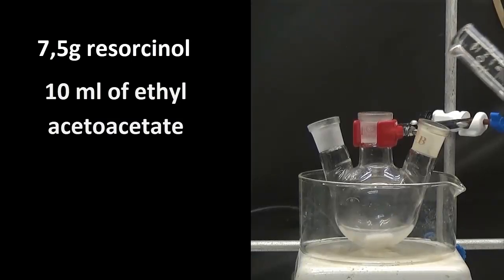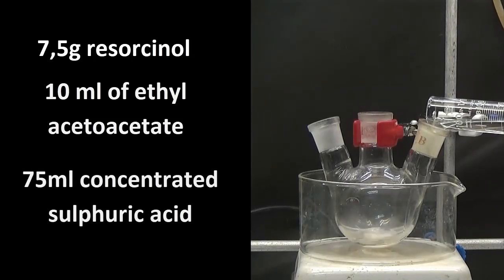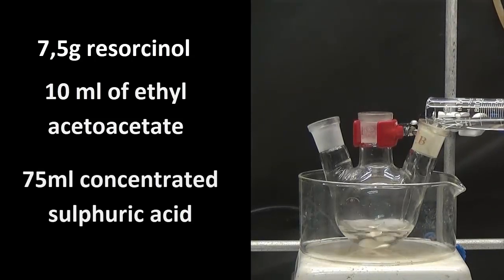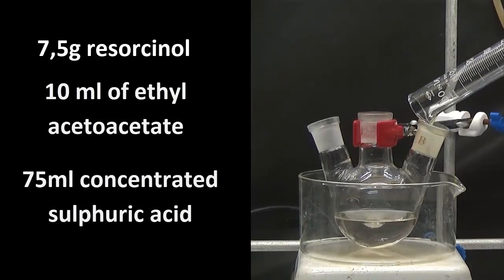In a 250 ml flask with a cold bath, we add 75 ml of concentrated sulfuric acid and equip it with a thermometer and an addition funnel.